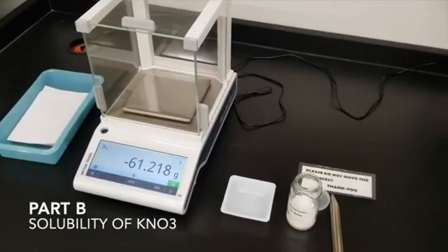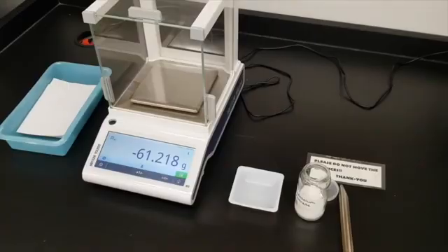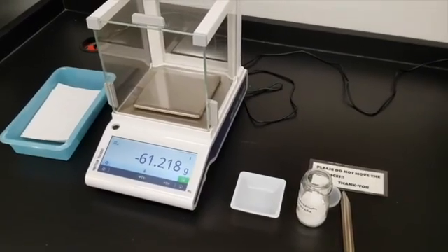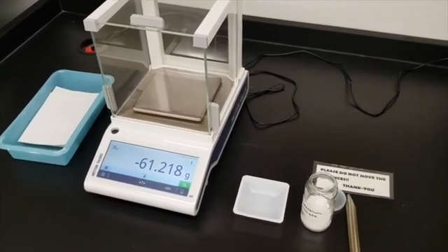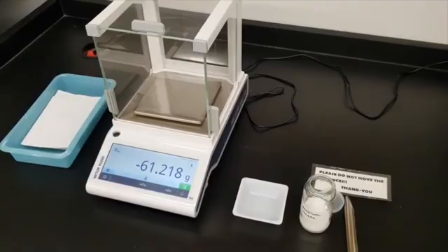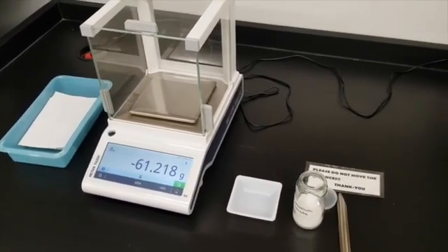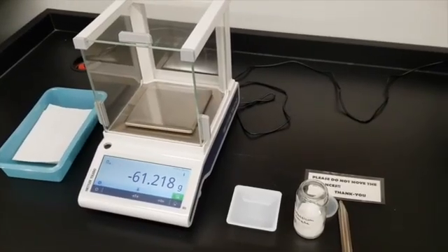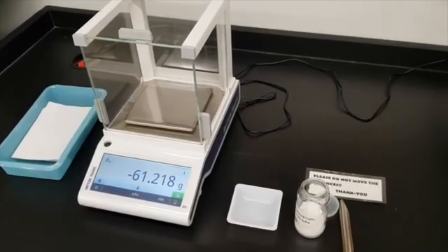In the next part of this lab, we're going to draw a solubility curve for potassium nitrate. Ordinarily, you plot solubility versus temperature by seeing what the solubility values are at various temperatures. We're going to do this lab a little bit backwards. We're going to measure out potassium nitrate and figure out at what temperature that amount would make a solution saturated.